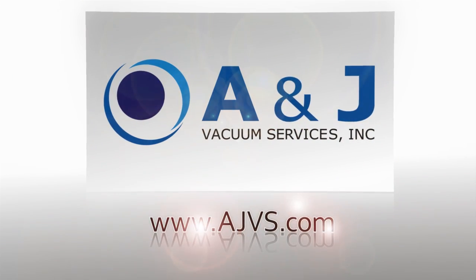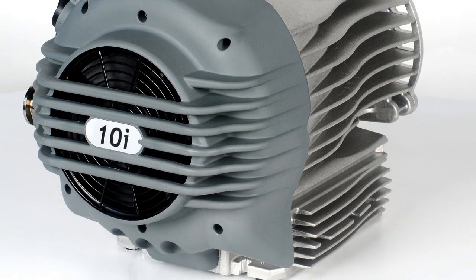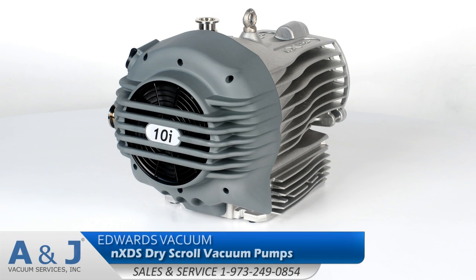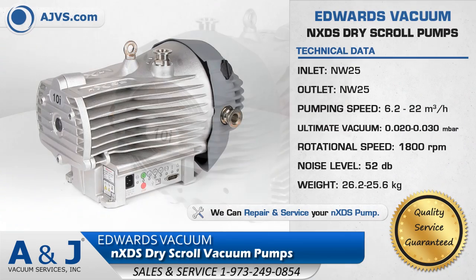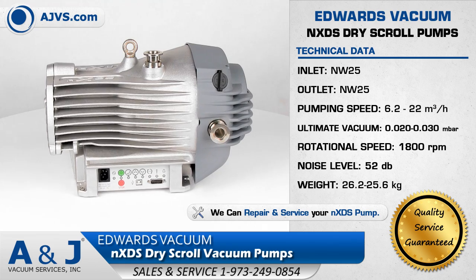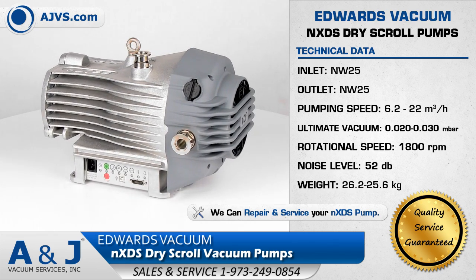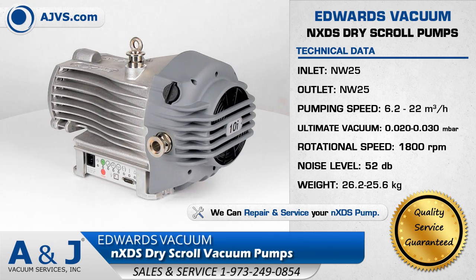AJVS.com, your worldwide leader of high vacuum equipment. The Edwards Vacuum NXDS Dry Scroll Vacuum Pump Series features exceptional pumping capability, ultimate vacuum performance, and state-of-the-art design features.